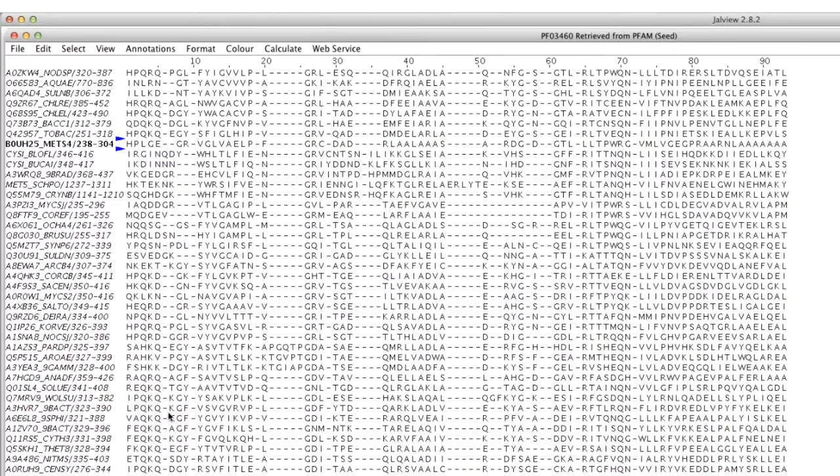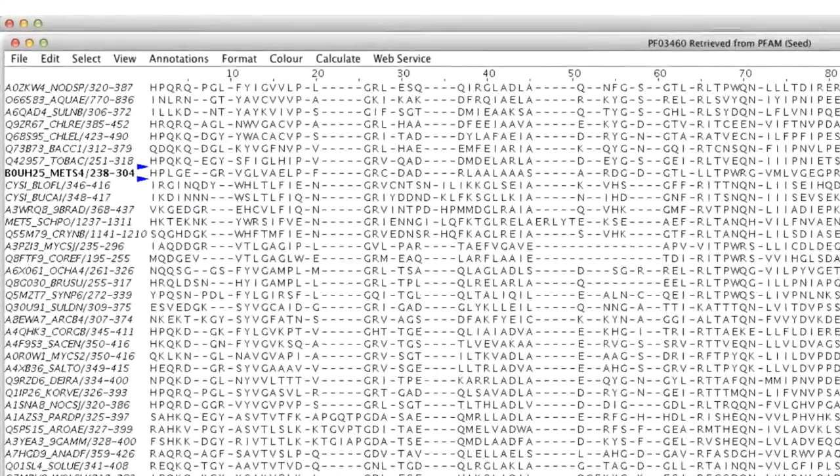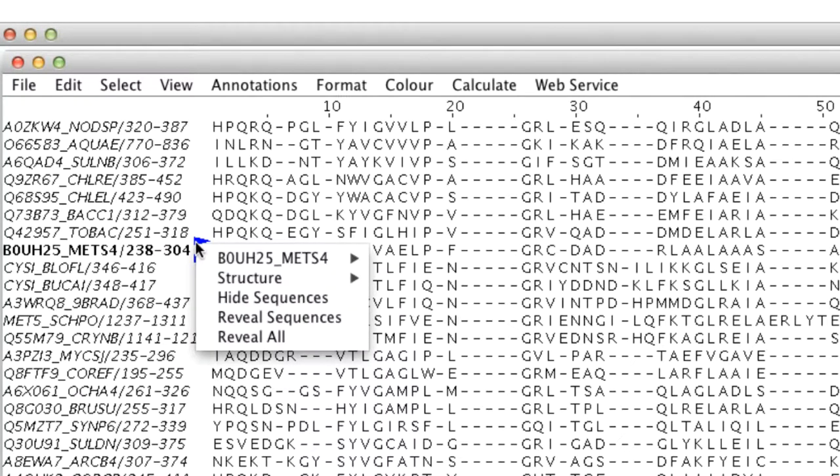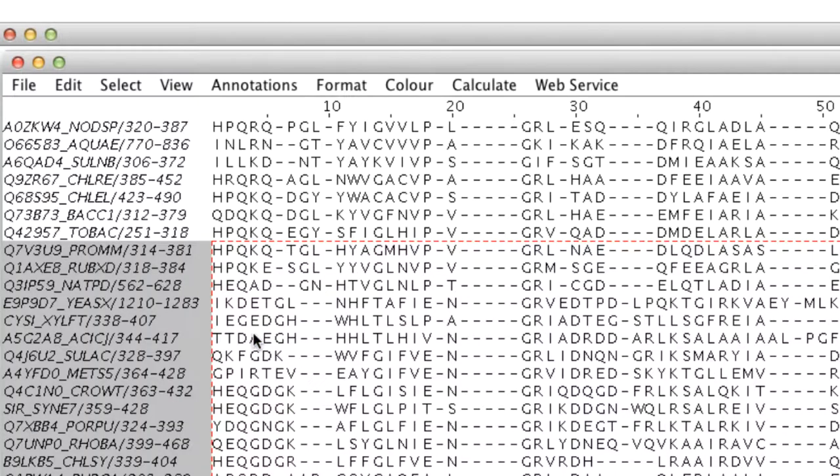The single representative sequence is now in bold text and flanked by two blue arrows. Any editing on this sequence will affect the whole sequence group. Selecting the reveal all option in the context menu will reveal the sequences.